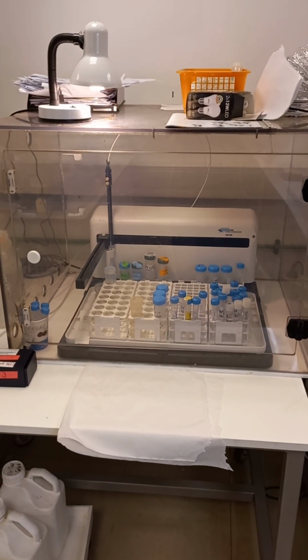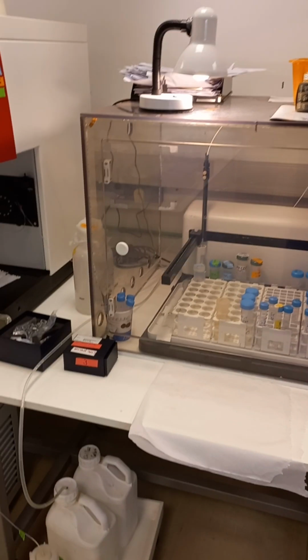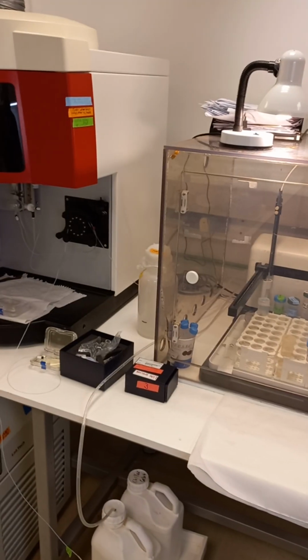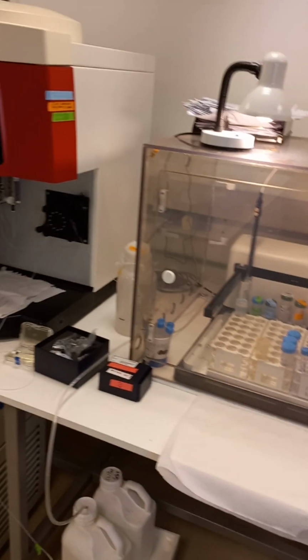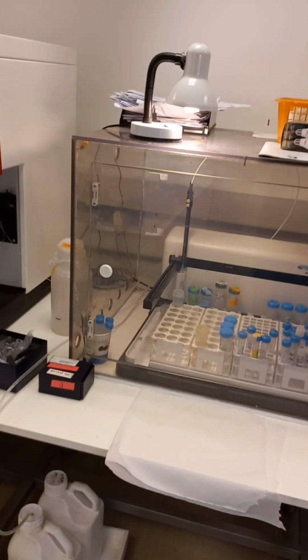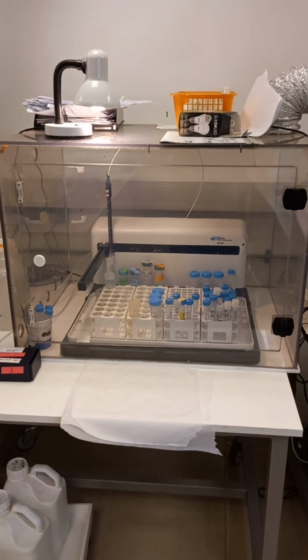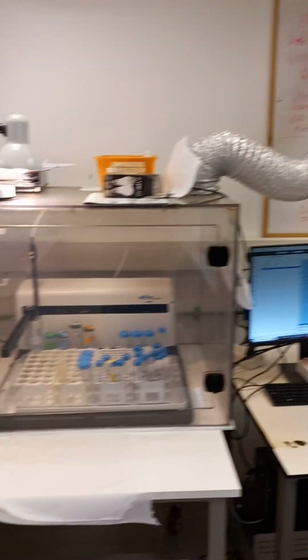When you are measuring acidic samples, mostly samples digested with acid, they contain at least 10% nitric acid, maybe HCl. And if HCl, you may feel the smell of this acid. The nitric acid has no smell. So if you are working with open vials and sitting for hours near the instrument, the samples evaporate and you are breathing the dangerous acid. So we built this hood by ourselves. We ordered it specifically. It's not a part of the deal with Analytik Jena. And this hood has its own exhaust system.